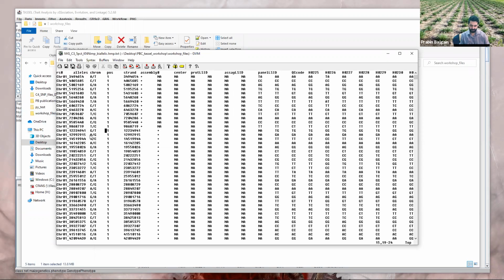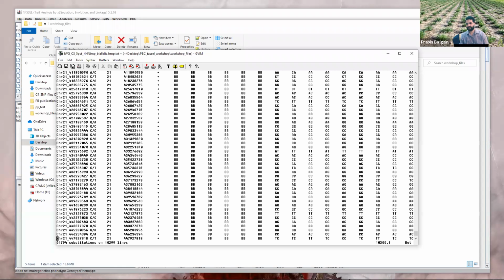In any case, if you hit a colon, you can do a few things. Let's say that I want to change everything as NA. This is just for demo. The missing values here to BB, because that would be something I don't have here, and that will be very obvious. It's very quick and easy. You search for NA, and you want to make those into BB. Global means G for global, all file. And it's extremely fast.